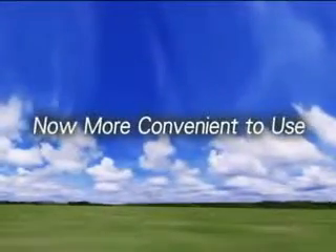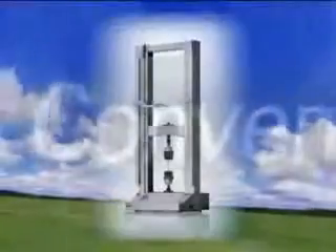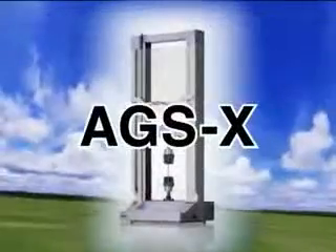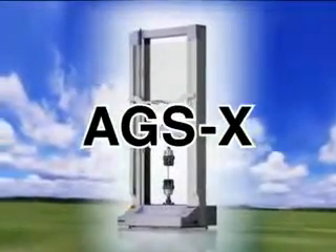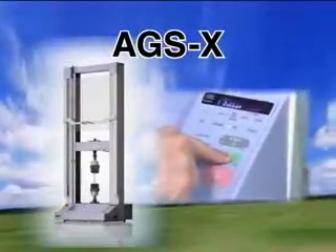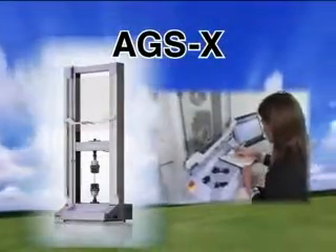Introducing the new AGSX, the latest completely redesigned version of Shimazu's AGS Series Tabletop Precision Universal Testing Machine. The AGSX allows anyone to perform tests easily and more safely.